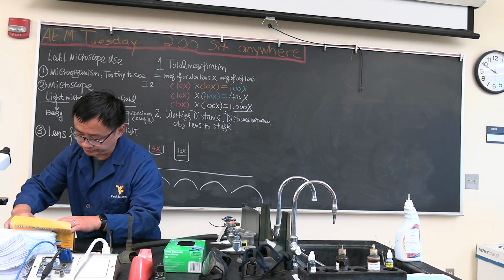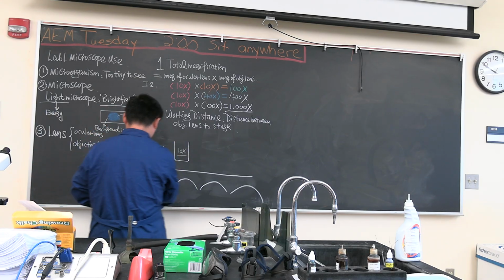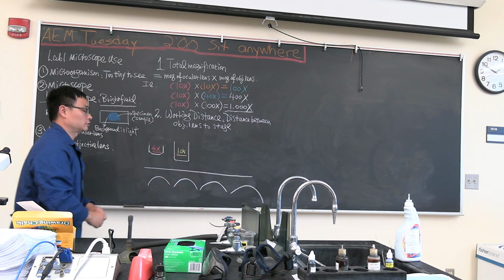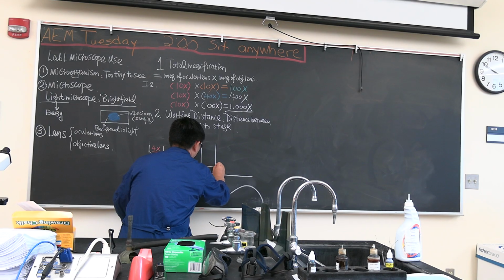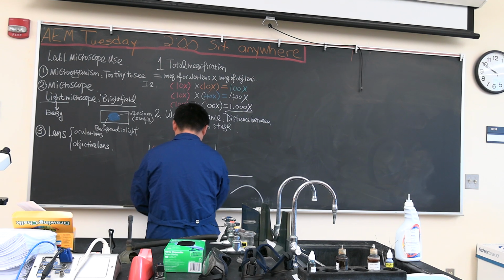Okay, we have 10x right here. Okay, the next one looks like this. 40x. The last one.